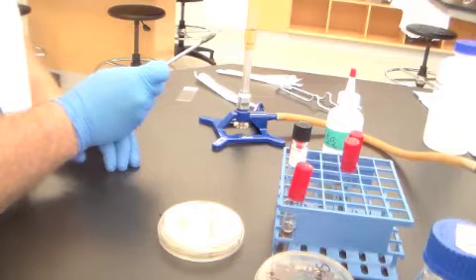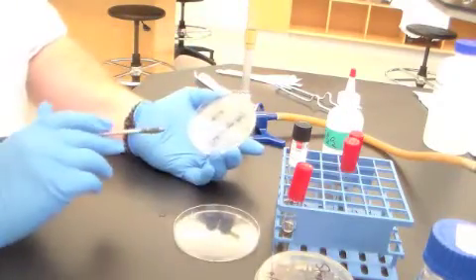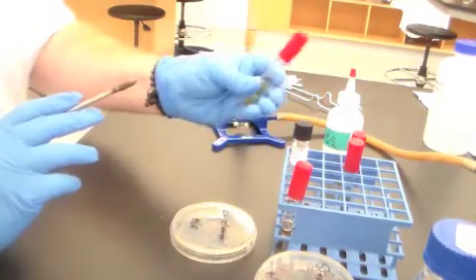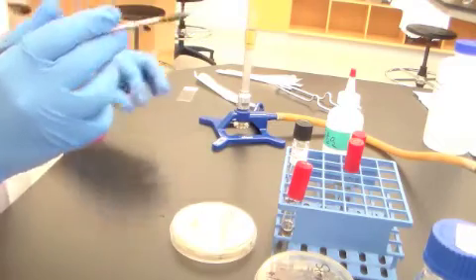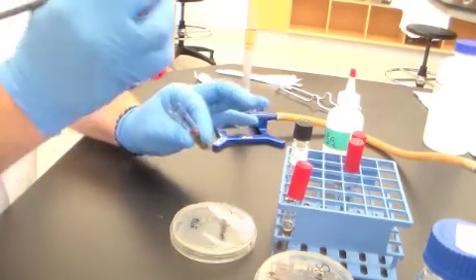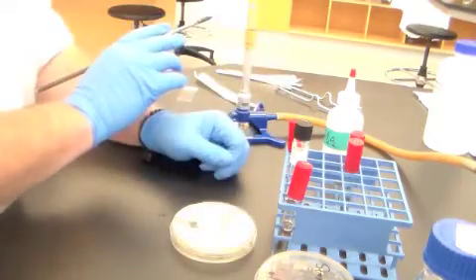You will also inoculate various other media with some of these gram-negative enterics like Enterobacter cloacae, such as the media that I'm going to inoculate next with just a single colony of Enterobacter cloacae that I've just touched. I'm going to go in. This is methyl red Voges Proskauer, or MRVP. Use your best sterile technique. Inoculate. Again, notice that I never set down the cover. That risks contamination. Put it back on, make sure that it's securely on. Sterilize the loop. Very simple.